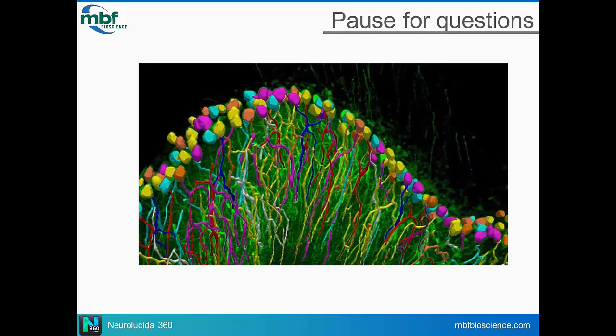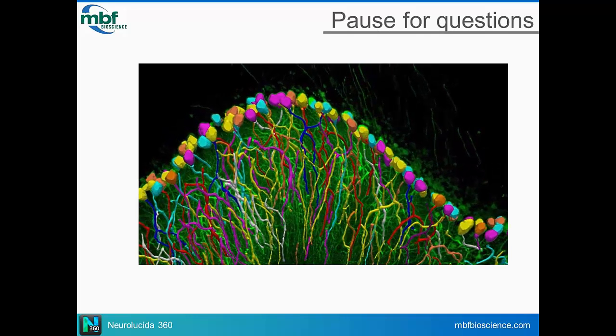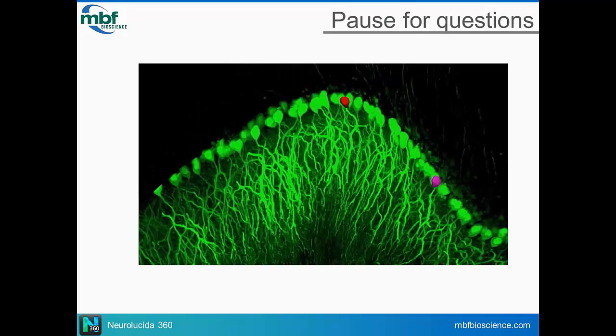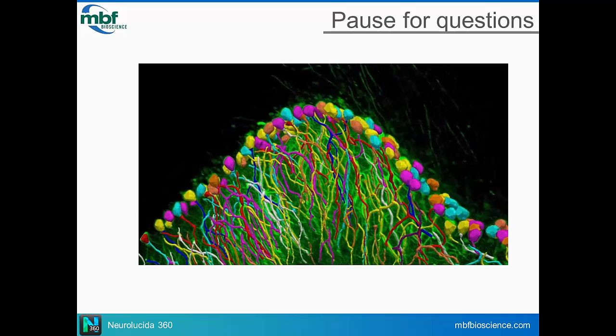Angela, Dara, has a quick question about how you injected the fluorescent dye for the cell loading. So what did you use? Did you use a pico spritzer? We use a glass micropipette. And so you can incubate the tissue in DAPI to figure out where you are in your brain section, if you're looking in a specific layer of the neocortex, like layer 2, 3, or if you want the pyramidal layer of the hippocampus, CA1 or something.